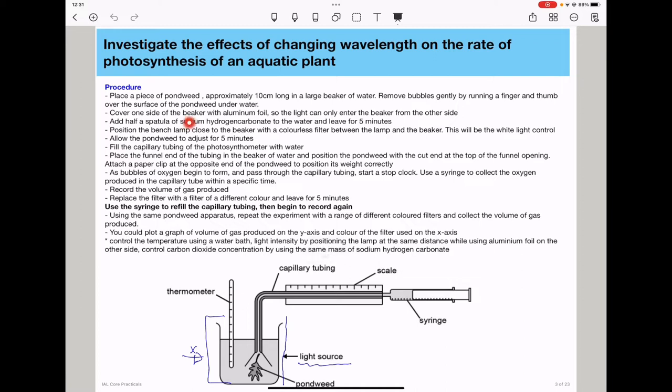Sodium hydrogen carbonate is going to provide a source of carbon dioxide, and for each experiment, we have to use the same mass so that we have the same amount of CO2 that the plant is exposed to. Then we'll position the bench lamp close to the beaker with a colorless filter between the lamp and the beaker. This is the position we're talking about. Between the beaker and the light source, we need to position a light filter, and this is going to provide a specific wavelength.